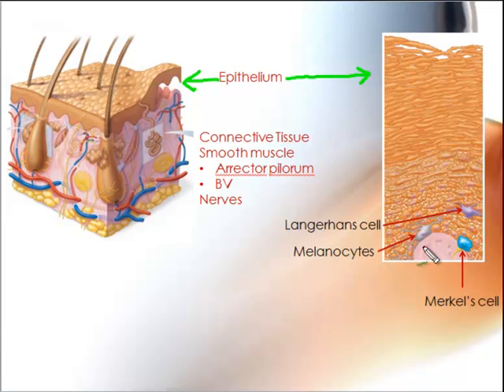So that's why you can see if you go from here, this would be where the basement membrane is. So this is where the basement membrane is. And these cells here, if you notice, there are no nuclei present. So this is where the cells are keratinized or dead.